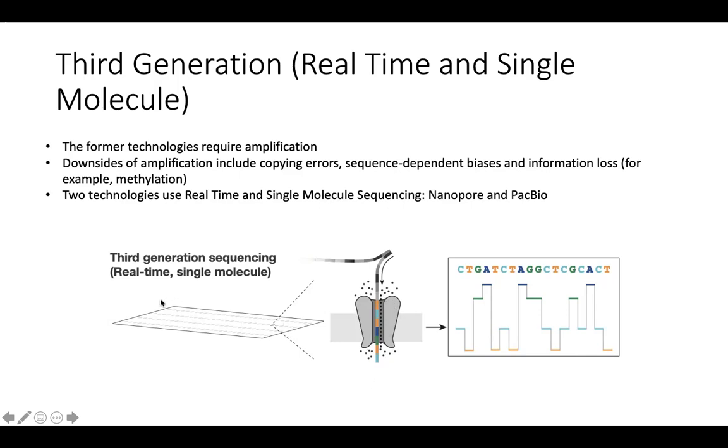In each pore, I don't know if this is still called the flow cell, but in each pore, what's happening is the translocation of a single-stranded DNA. And as the DNA trespasses the pore, there is a change in the electric current that is characteristic of the identity of each nucleotide.